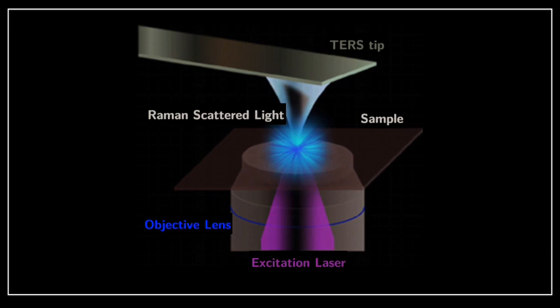But the point is, because of the tip effect, you want a very high local electric field. And by scanning the tip across the material, you hope to look at the local Raman response. So that's what TERS is about, and we call it NanoRaman when we go towards a resolution of about the nanometer scale. So in any case, here is the way the material works.